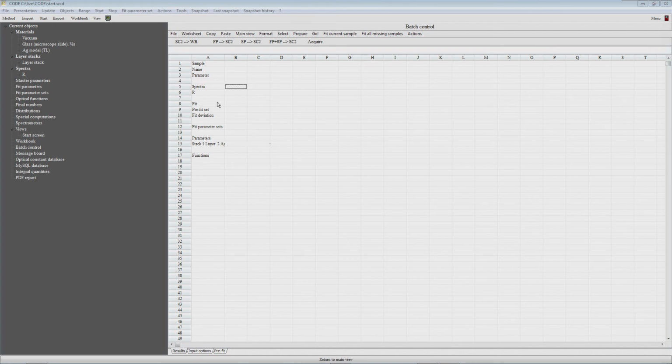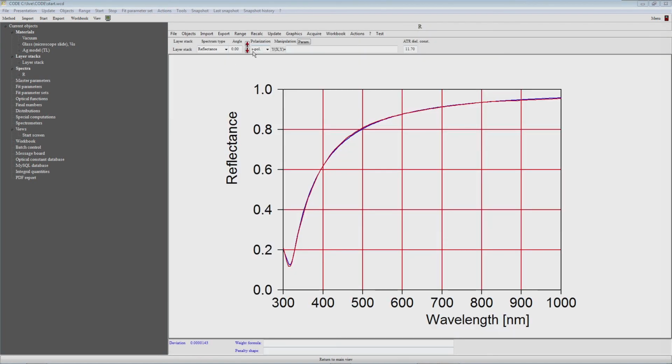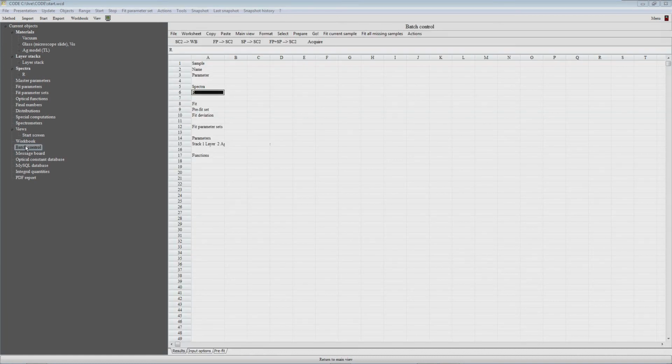Then there is a section about spectra that belong to these samples, and here there's only one spectrum, one reflectance spectrum in our oh, well, sorry, I have to go back. I have to check. In the case of reflectance, if I did everything correct, and for the spectrum here, it should be 8 degrees, and let's be super correct, mixed polarization, and everything else is okay.